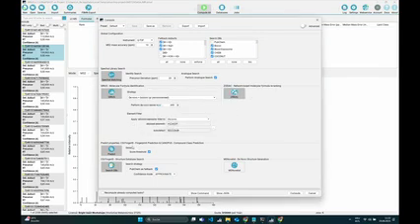Okay, the next thing, and I don't want to go into too much detail so this doesn't become overwhelming, is where we predict the fingerprints and also compound classes. People who are more familiar with SIRIUS 5 or earlier versions will remember there were two settings for fingerprints and for compound class prediction. This is now one setting which you can turn on, and the only option for this is the score threshold. By default, you only compute the fingerprints and make the class prediction for the molecular formulas above a certain score threshold, but if you want to have more predictions, you might want to disable the setting.